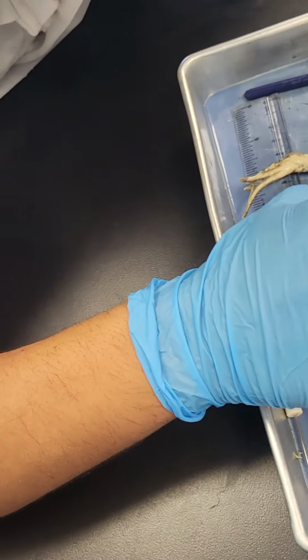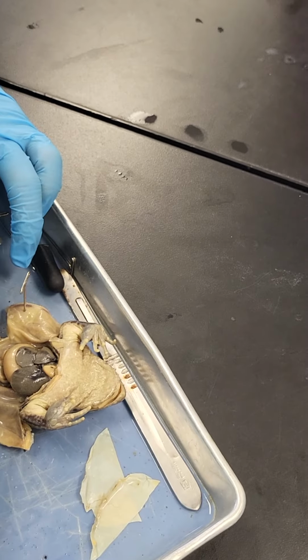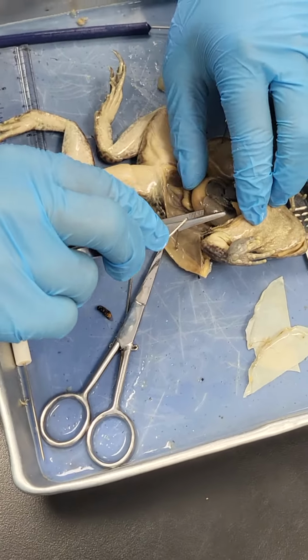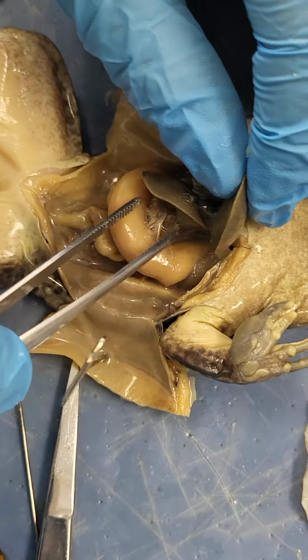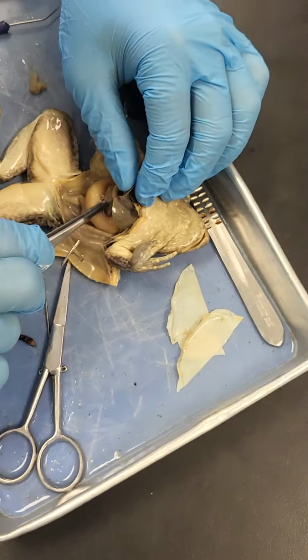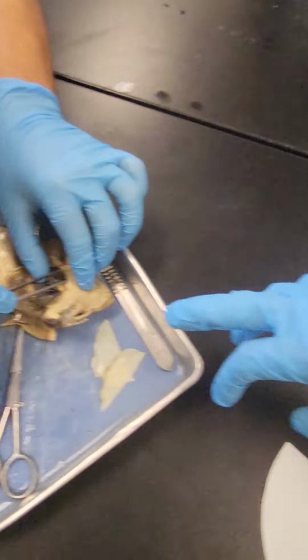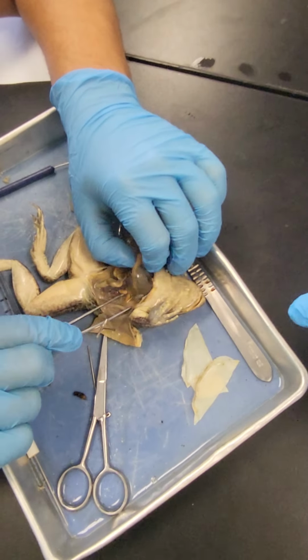A spiderweb-like membrane that covers many of the organs. Oh, we already found that. We already took it off. This smells nasty. Find the liver. Right here. It's the big boy. The big black one. Those are the lungs, right? The heart's the little white thing right there. Lungs. Wait, go look under. They're under. Right there, there's the lung.